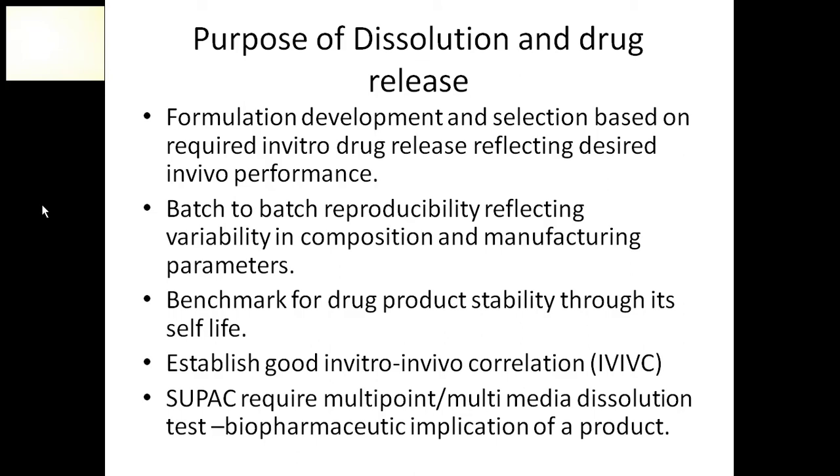Lastly, scale up for post-approval changes generally requires multi-point as well as multimedia dissolution tests, which is responsible for substantial biopharmaceutical implication of a product, and if necessary, bioequivalence studies are also performed to validate the dissolution test. So for the scale-up process also, we need to justify the changes to be the same by doing a multi-point as well as multimedia, that is using different media concentrations, in order to justify the changes if occurred during the scale-up process.